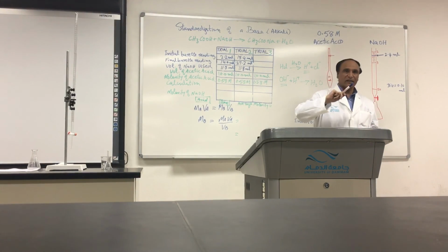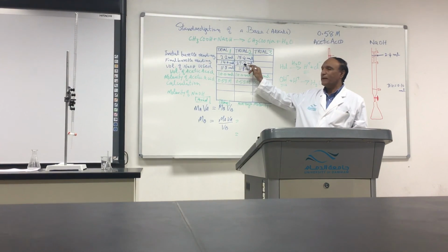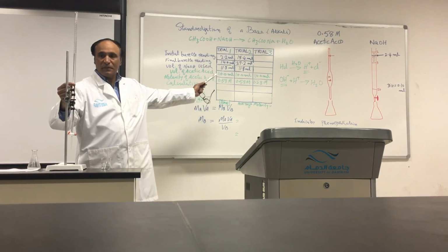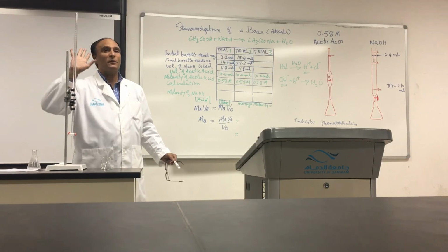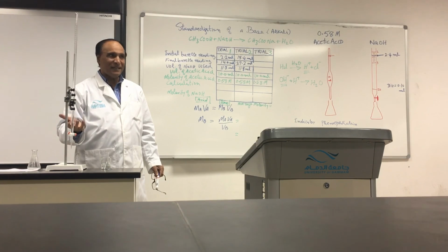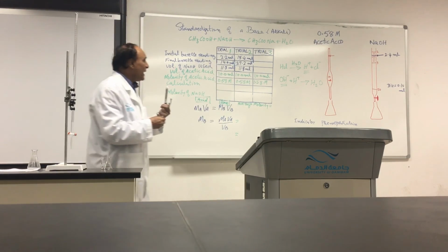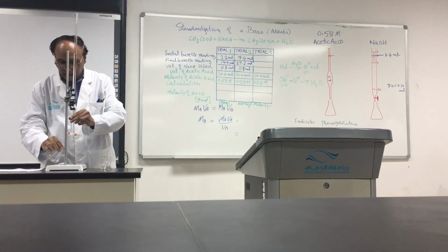Listen, why did I do this calculation? I know I will go to 27.2. I know this from the calculation. So if up to 25 I add directly, there will be no problem. I will save my time. Did you understand? Everybody understand? That's why I did. Maybe this is a little wrong, but I will add 25 or 25.5 directly into that.